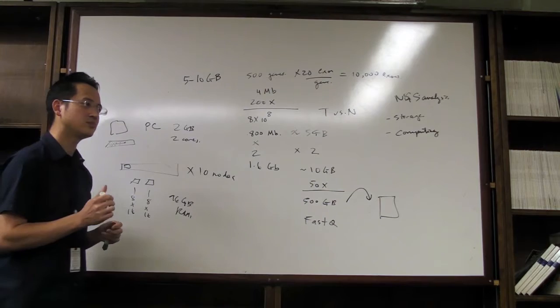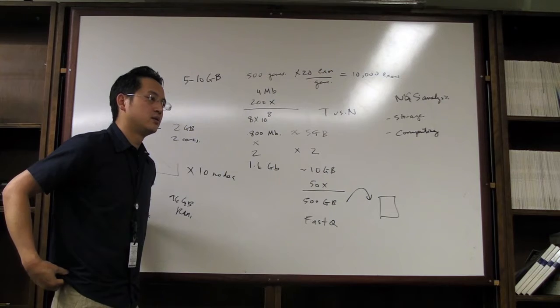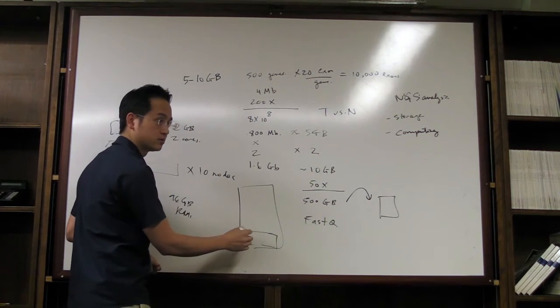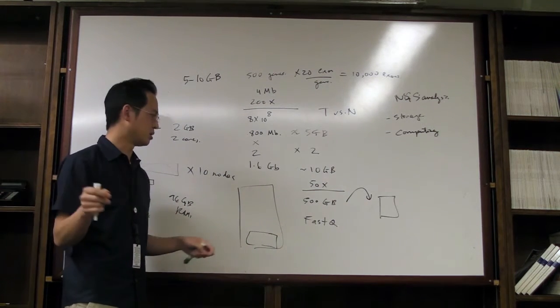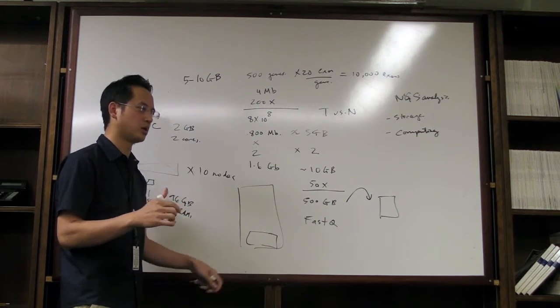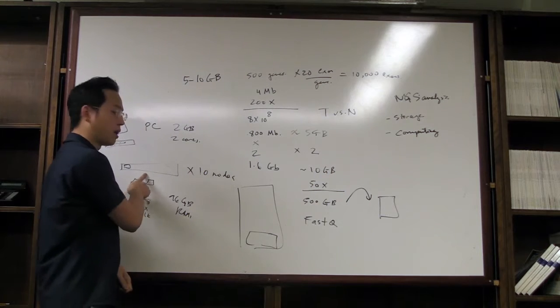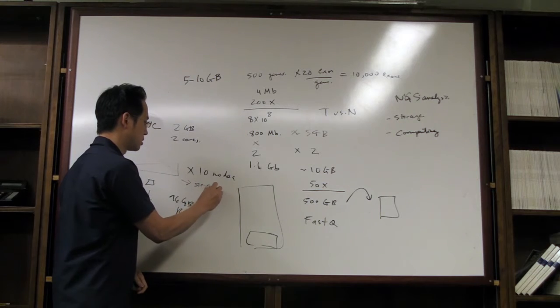So do you put one of those clusters separated by 1 computer? How does it work? The cluster, do you just plug it in to 1 computer and you're done? So the way this will work is you have a huge power supply down here, way more than what you would have in a wall outlet. So it needs access to, I think, 230 or 220 volts either way. So you need to get B&G to come in and install enough power to run this, because each one would probably be sucking up 500 to 900 watts of power.